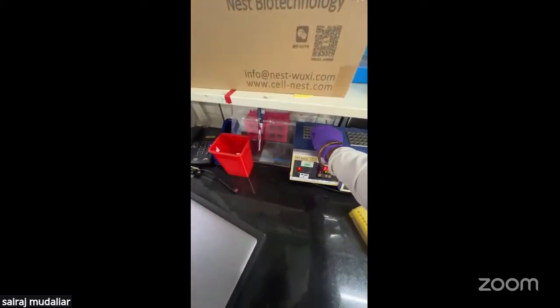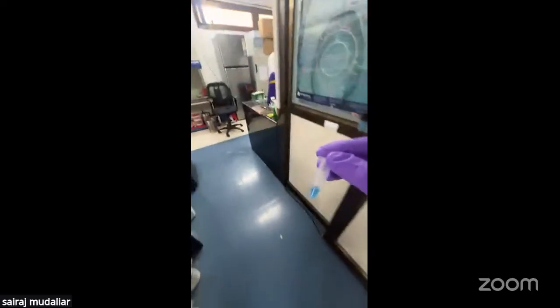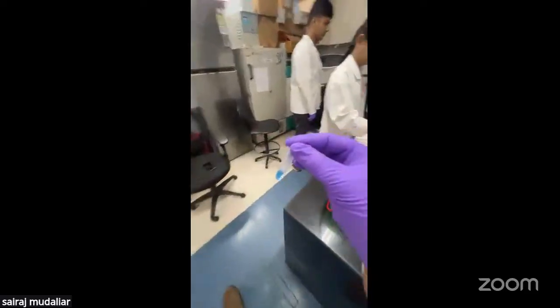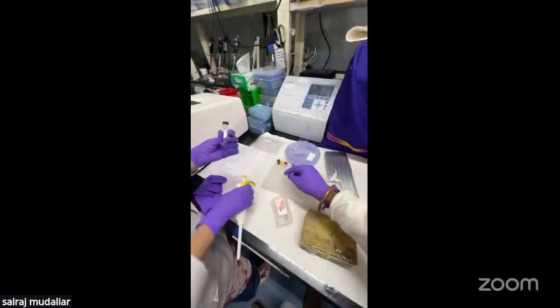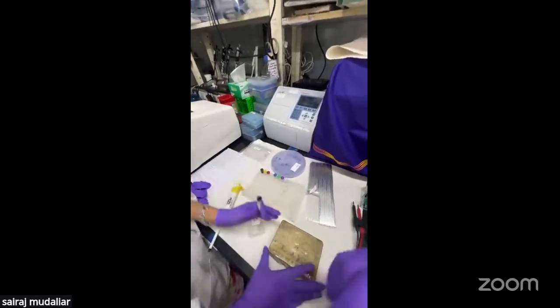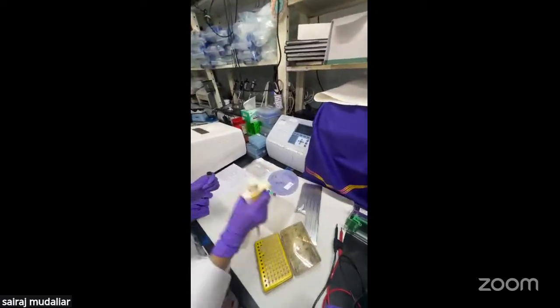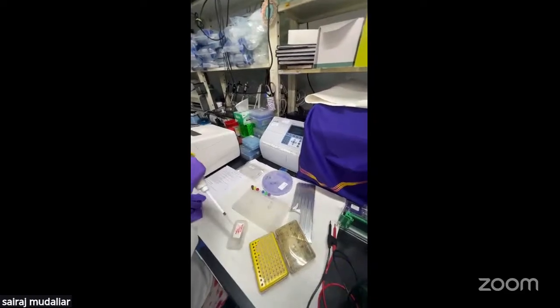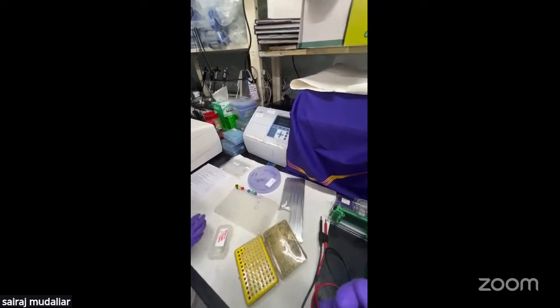Once the peptide is taken out after 4 hours of digestion, so these are the peptide samples. We will add this stop solution. The logic of adding this solution is quenching the reaction. What do you mean by the quenching? The overall trypsin activity can lead to complete degradation of the peptides.